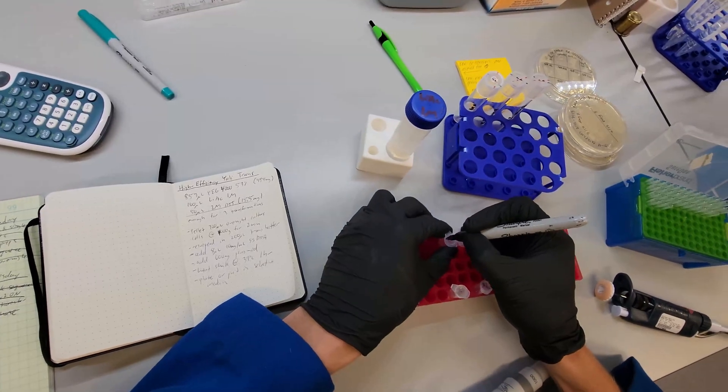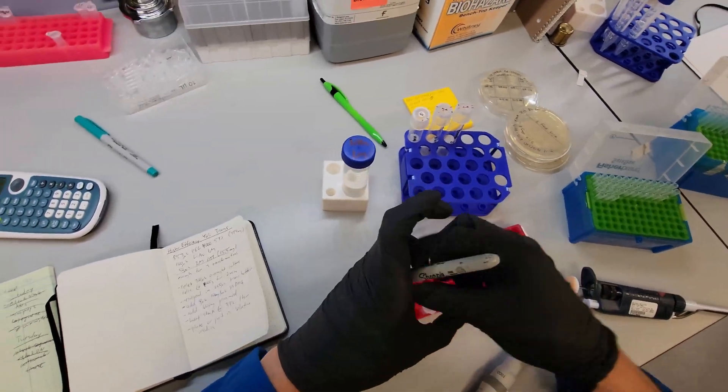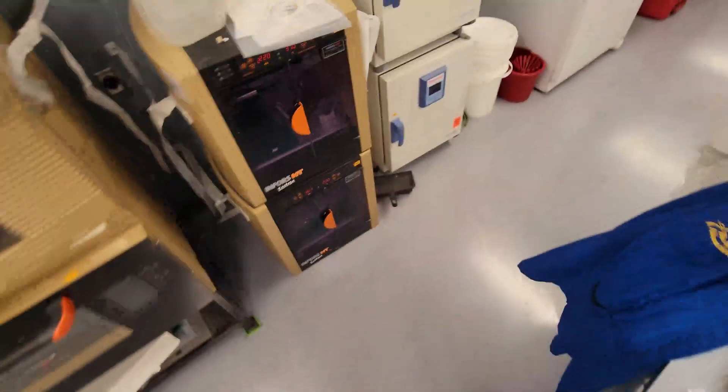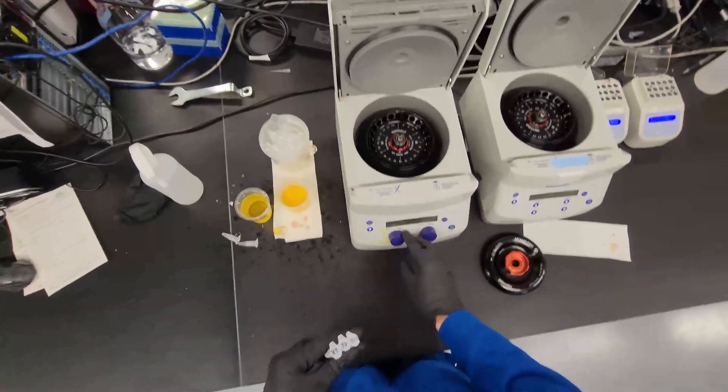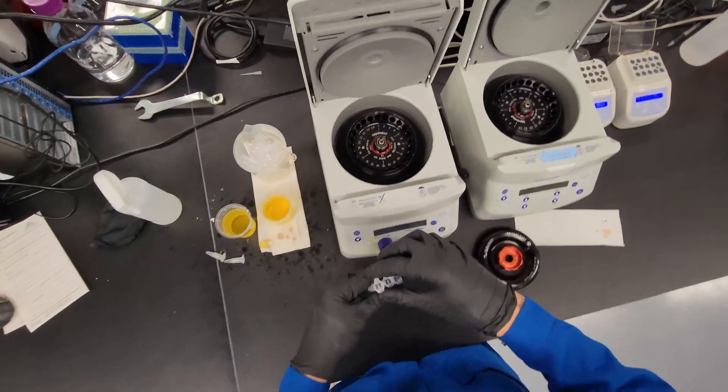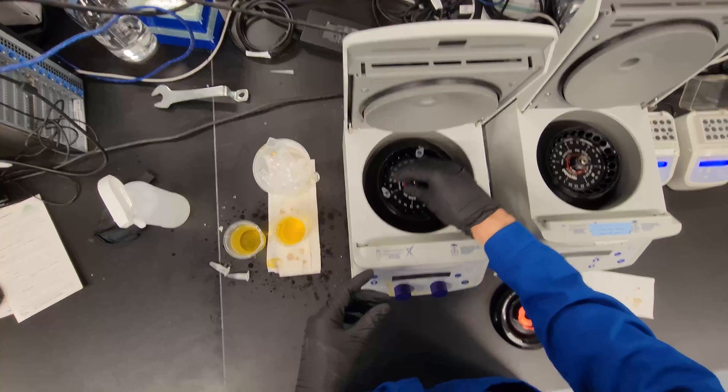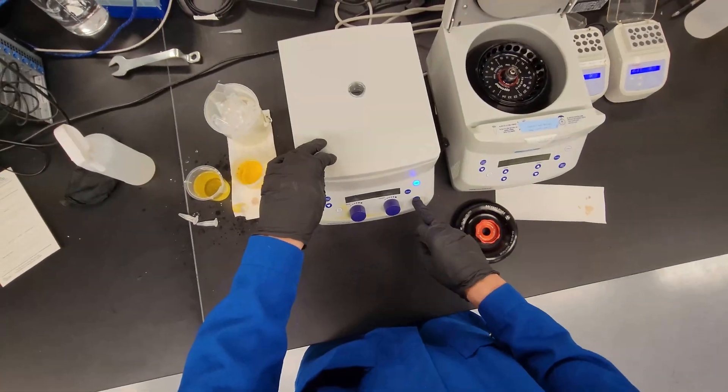So we got Z4, Z8, and Z12. You'll notice that I cheated a little bit. I used 500 microliters of cells. I just really want this transformation to work. This is one of those transformations that we just need one colony. But it's also a transformation that we've had a lot of issues with. So I just want to be certain that we get at least one colony. And I'll show you other ways to guarantee that later in the protocol. So we'll let that spin.